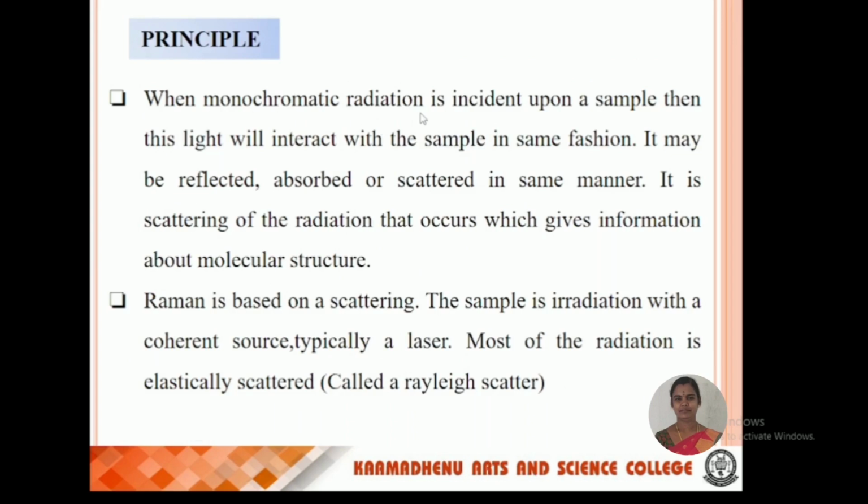Then principle. When monochromatic radiation is incident upon a sample, this light will interact with the sample in some fashion. It may be reflected, absorbed or scattered. It is the scattering of the radiation that occurs which gives information about molecular structure. Raman is based on scattering.